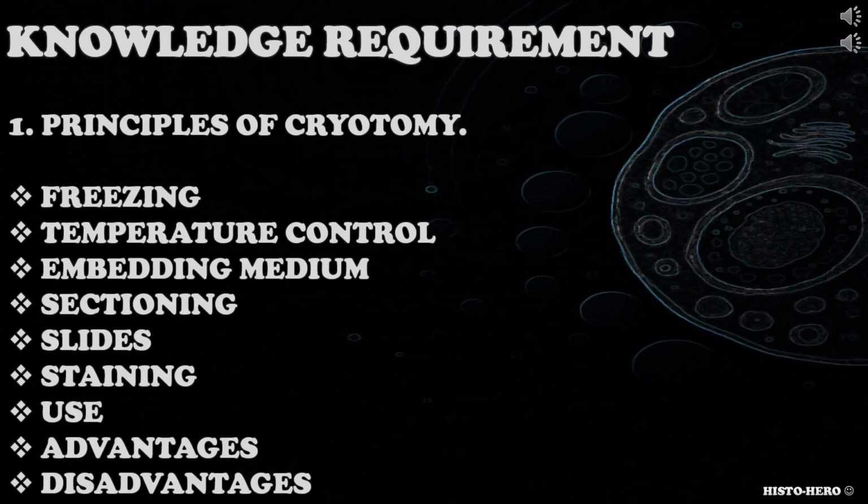When addressing this knowledge requirement, candidates should consider freezing of the samples, temperature control, embedding medium, sectioning technique, slides used, staining protocols, advantages and disadvantages of cryotomy, situations when cryotomy needs to be used, and differences between cryotomy and microtomy.